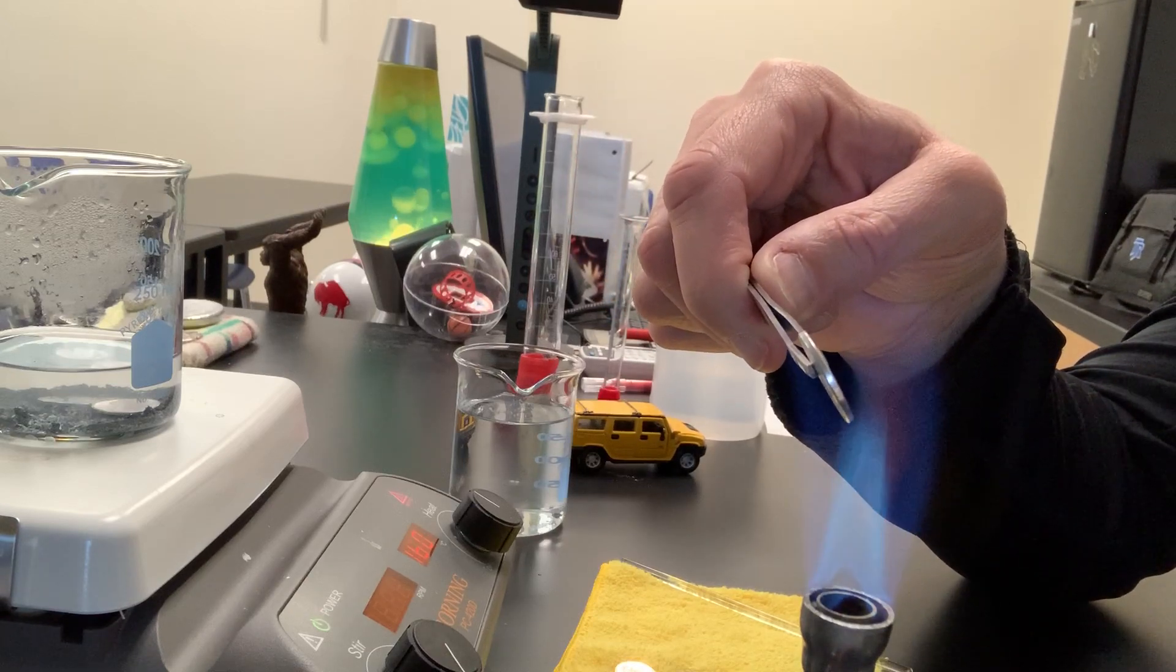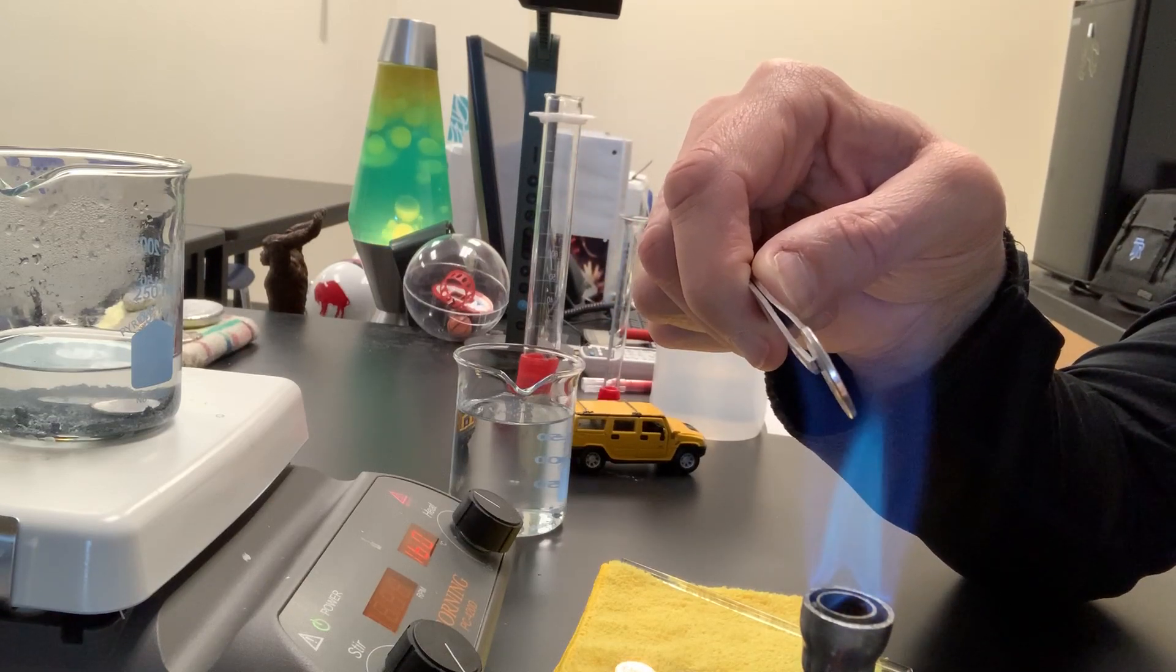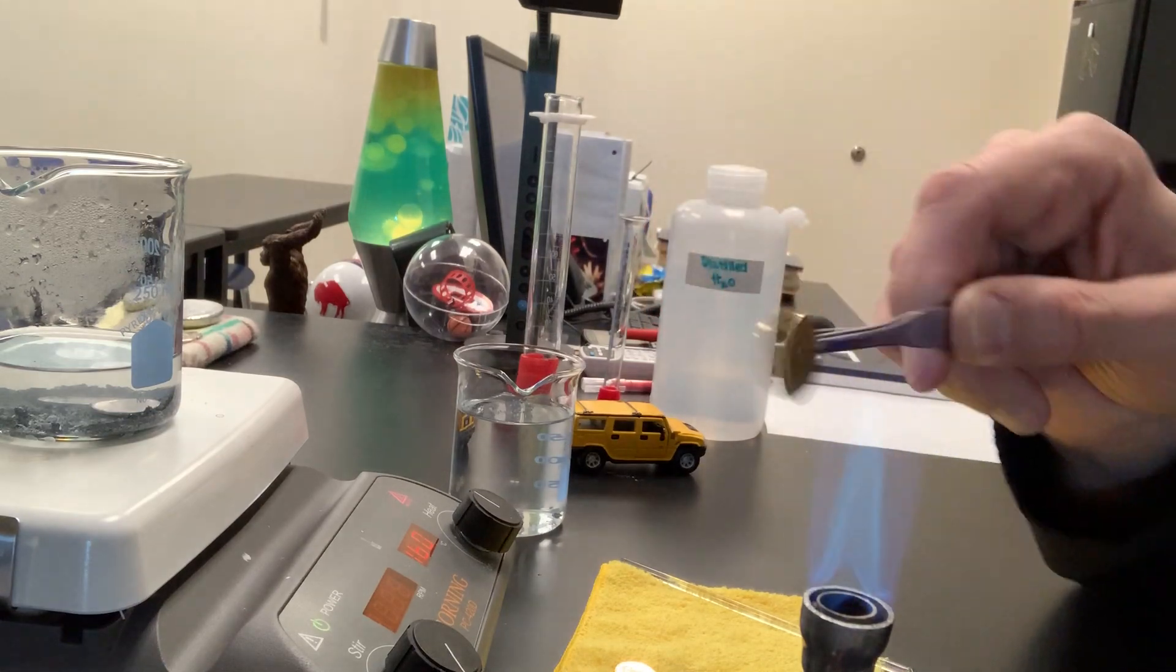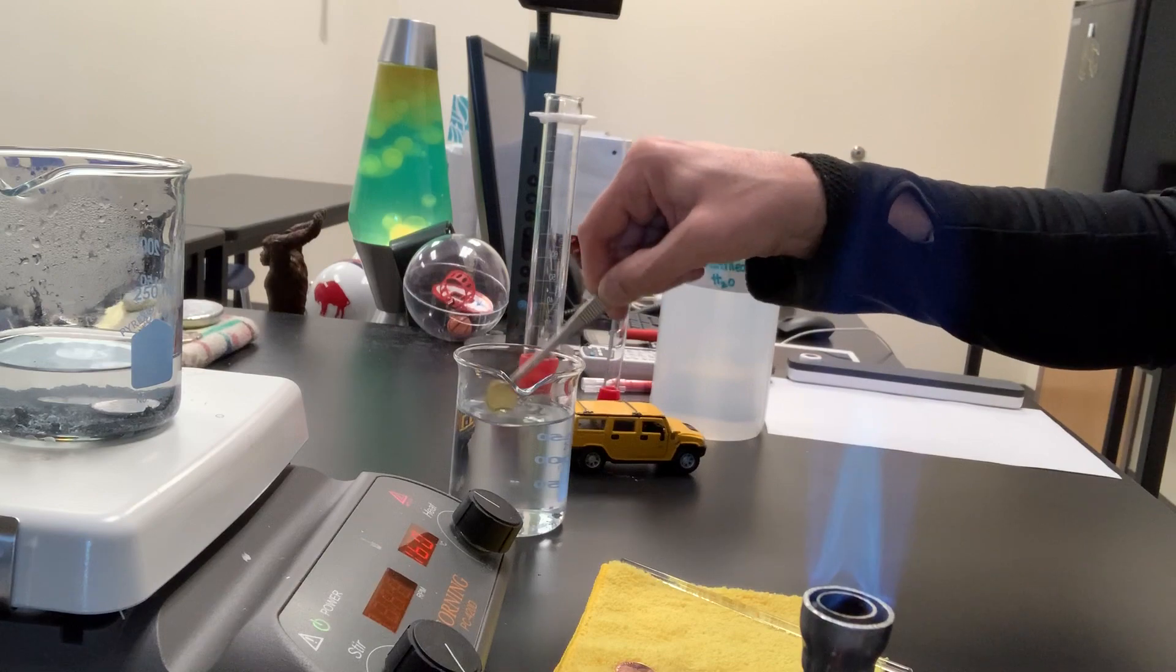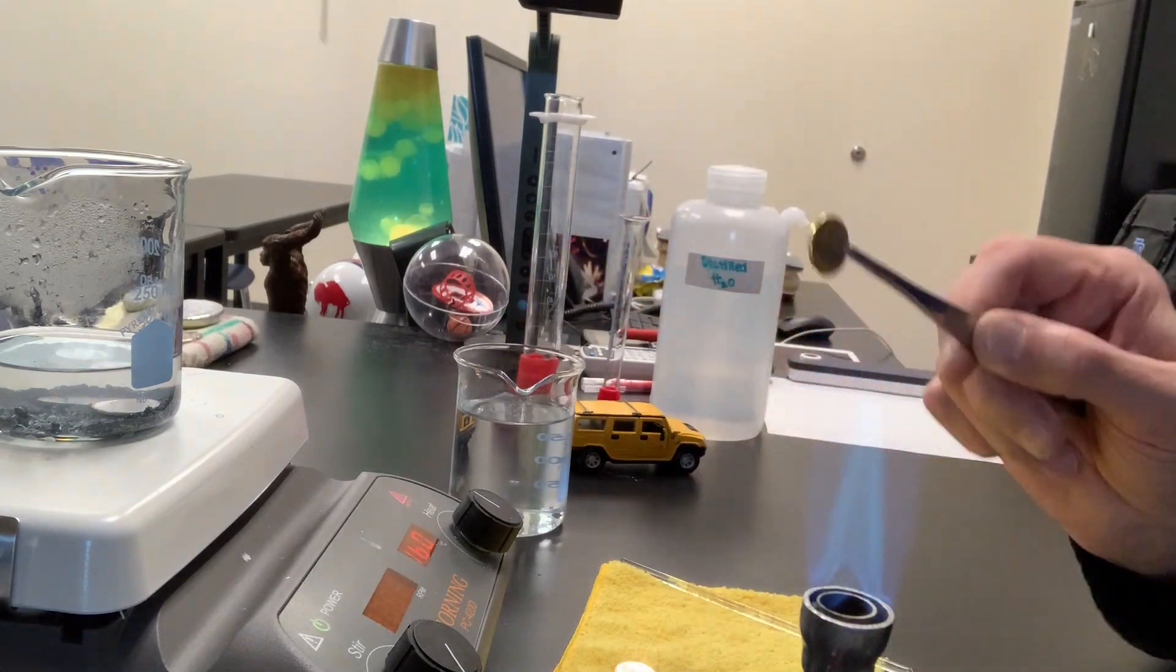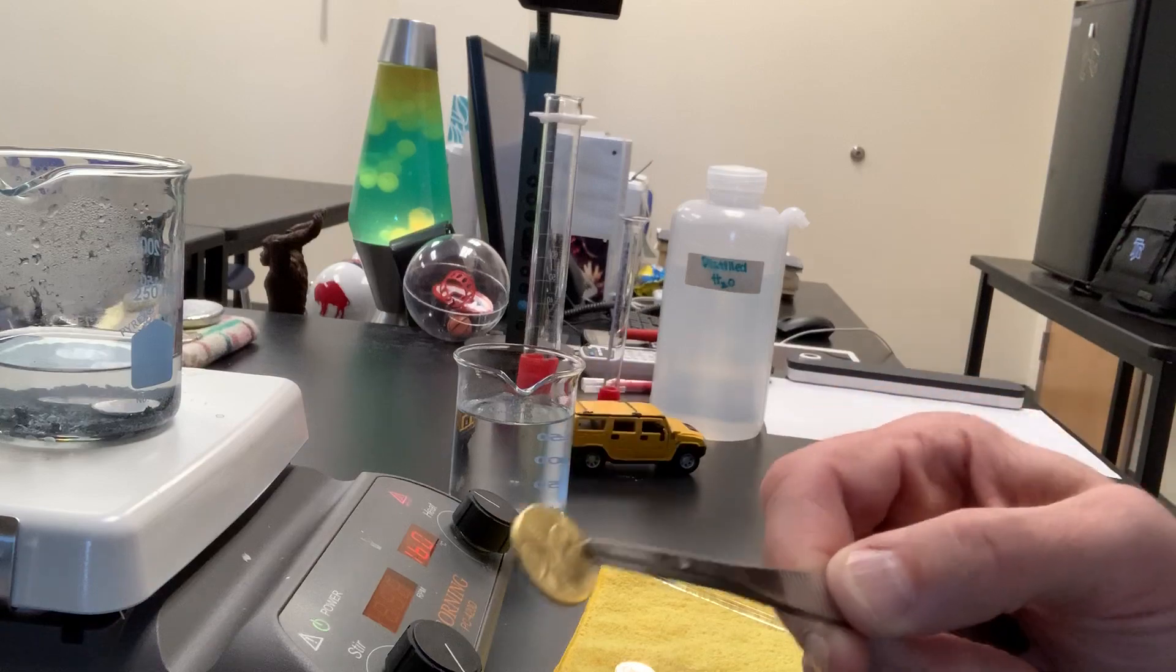We'll place it right in there, and as soon as I see a color change I want to take it out of the flame, which I just did now, and quench it in distilled water. I've made a brass penny, a brass-coated penny.